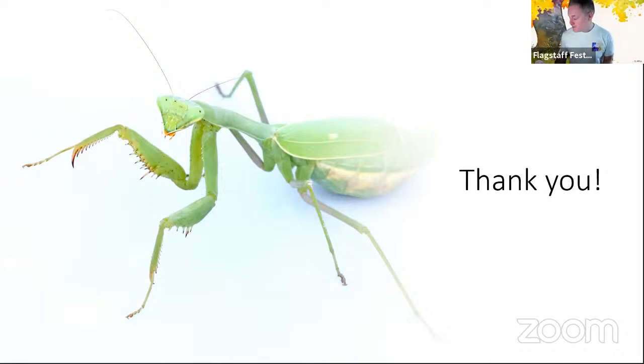I do have more questions. One of the first things that caught my eye early in the talk was you said you had a setup to do 12 millimeters, 1 millimeter in size, or I'm sorry, 1 meter in size specimens. And then I thought to myself, oh God, 1 millimeter, maybe I said something wrong. From the thrips. That would have been a big thrip. The thrips are 1 millimeter.